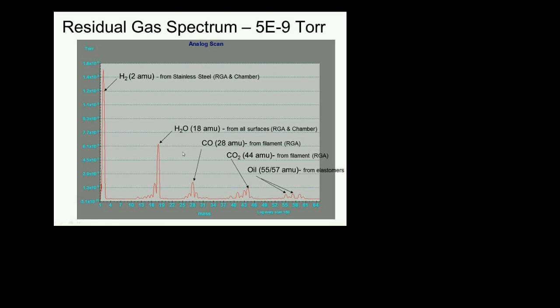Where is that coming from? Well, there is carbon on the filament. The water is reacting with that carbon on the very hot filament and producing carbon monoxide and carbon dioxide.